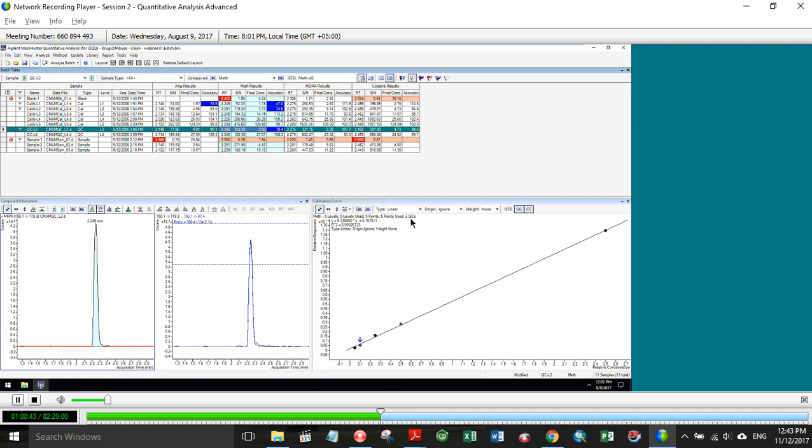It takes me 30, 45 minutes for a run, an hour for a run. I don't want to have to spend that much time every day running that curve. So what I could do there is take yesterday's calibration curve. I run a CC. If that CC follows a certain criteria, which I could set, then I can use yesterday's calibration curve, the response factors from yesterday's calibration curve, in today's work. A QC, on the other hand, is just a quality control.